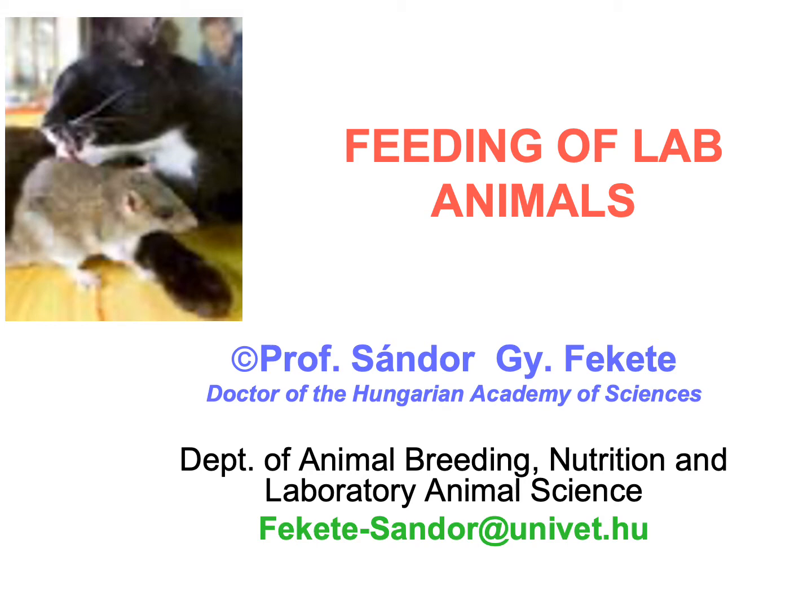Therefore, the difference of the biological answer between the experimental group and the control group is owed to our experimental stimuli. Therefore, we had to make all these standardizations, including the feeding of the laboratory animals.